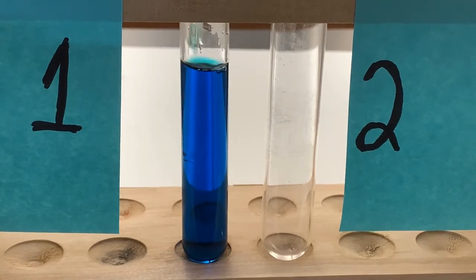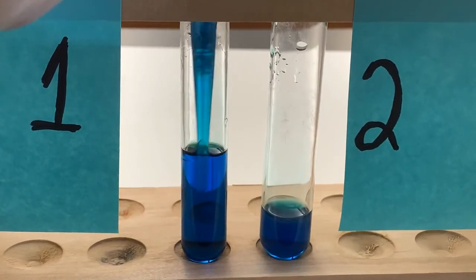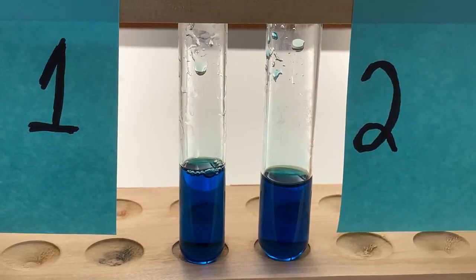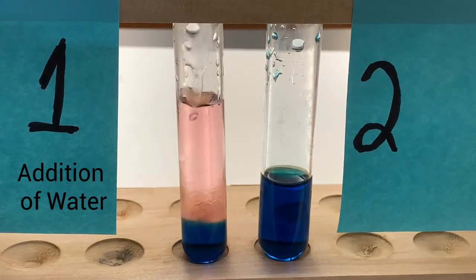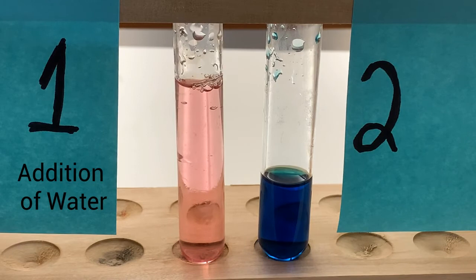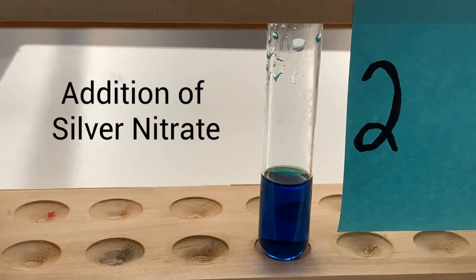Next, I'm going to transfer about half of the contents out of test tube 1 and into test tube 2, just so we have 2 samples we can work with. And then into test tube 1, I will add distilled water. Just give it a little stir there. Now to the sample in test tube 2, I'm going to add silver nitrate.